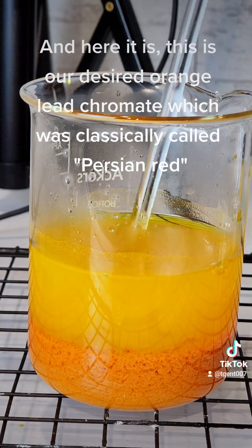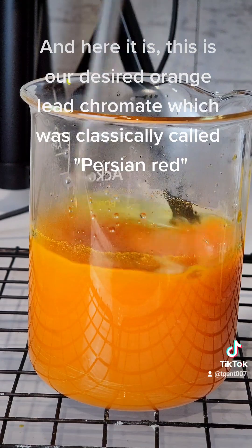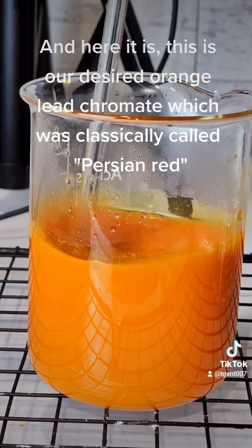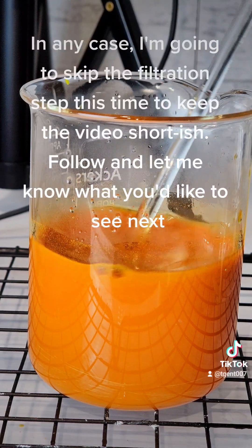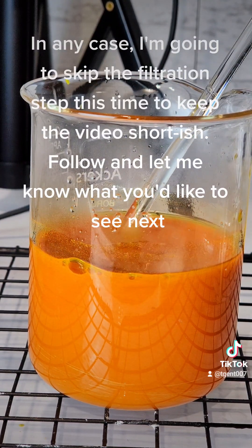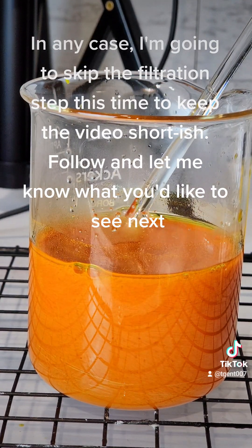And here it is. This is our desired orange lead chromate, which was classically called Persian Red. This pigment was used extensively in Friedrich Leighton's Flaming June.